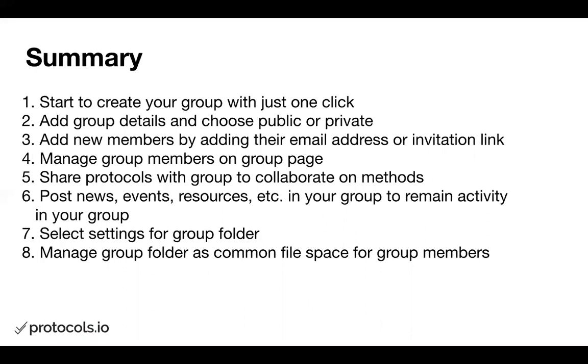To keep your group very active, you can post news, events, and any resources your group uses, as a space for your group members to get all the information they need to get started. Also, for the group folder, you have different options to select settings. So you can decide if people should be able to share or not share, or publish or not publish, and different things like that. And the group folder is really the common file space for your group members, and most of the collaboration will go through that.